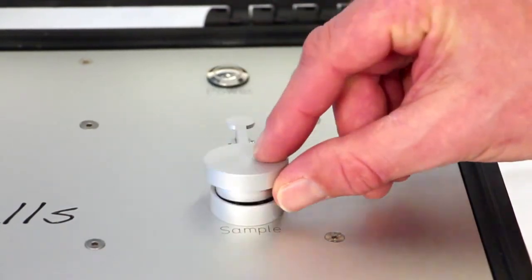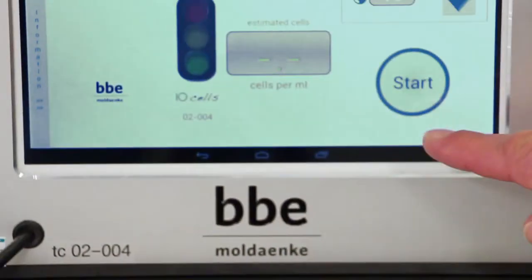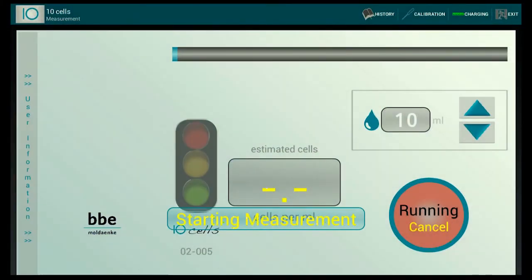Close the cap of the slot and start the measurement by pressing the start button on the display. The measurement needs approximately one minute. Then you can read the result.